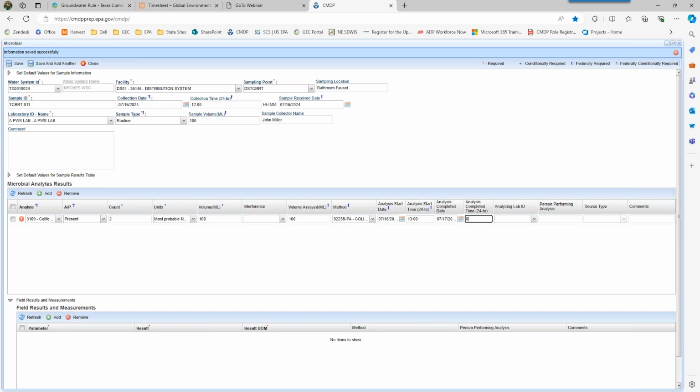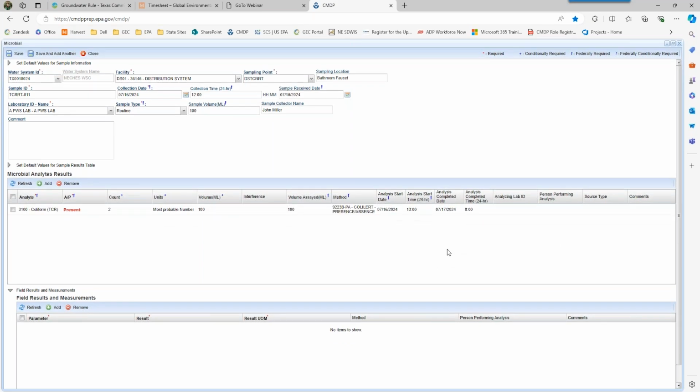Oops, that's not what I wanted. Actually, we'll change that as well. Just showing what some more errors look like again in that time. There, so we fixed that. Hopefully, it's still blue, so we'll see. And then we'll go ahead and add our E. coli.